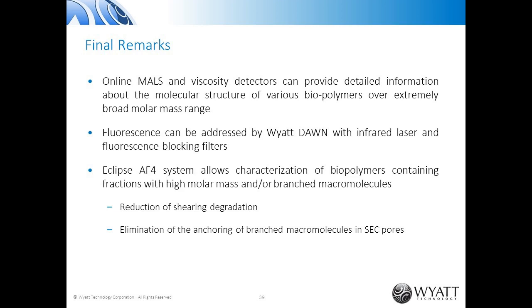For polymers that are not soluble and highly cross-linked, would the AF4 technique be suitable for the determination of molecular weight? If the polymers are highly cross-linked, and that means that they create some supermolecular structures where we have more macromolecular chains than just a single chain, then SEC cannot be used at all. And if these species are still dispersible, if they create, let's say, some type of nanogels, then they can be separated by AF4, and the response in light scattering is very strong, so they can be nicely measured.